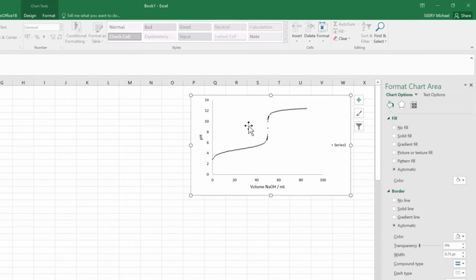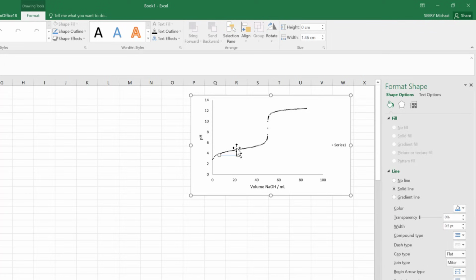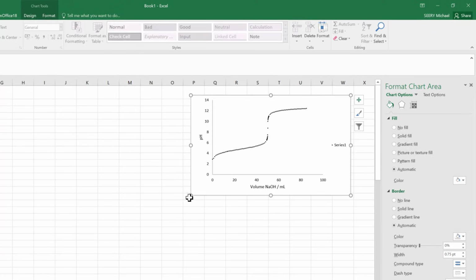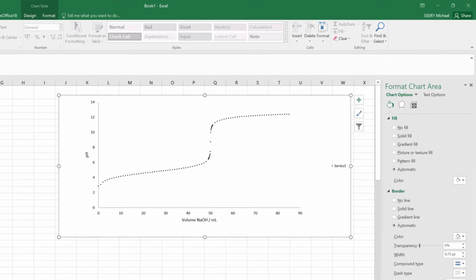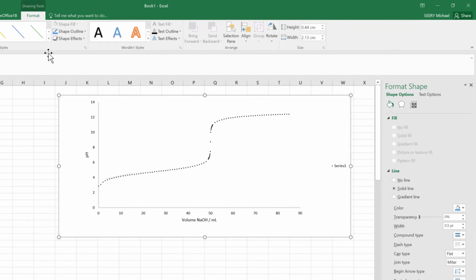Okay, let's park there for the moment, because now what we want to do is draw a plot of the derivative of this curve. In other words, if I take a tool here to draw the slope, so for example the slope at this point here, I'm just going to make this much bigger. So let me just go to Insert, Shape. So the slope at this point here maybe is going to be like that steepness, just make that black.